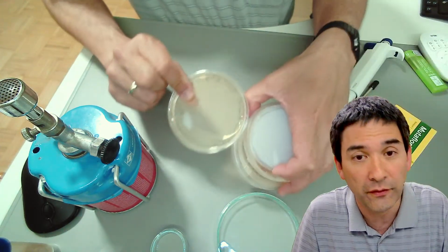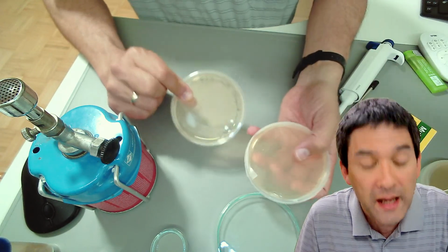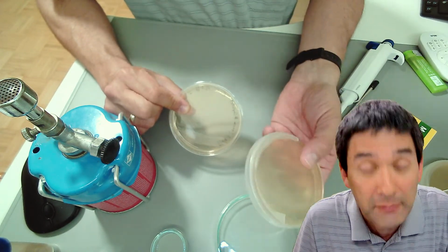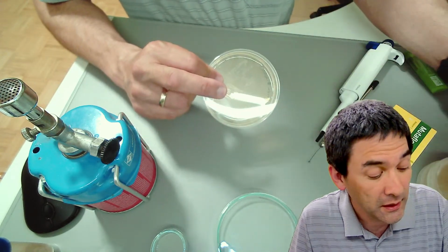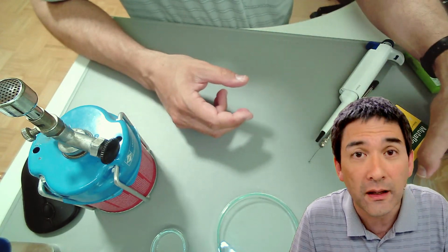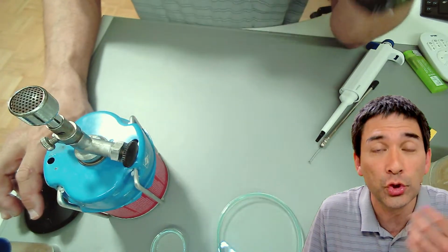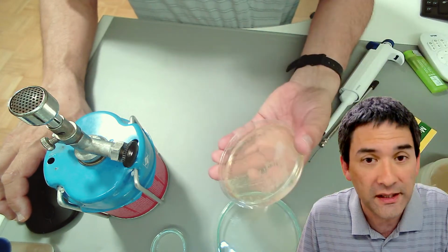And those agar plates that I've got here, I've got a few of them that I'll be using. They are commercially made. I actually bought them on Amazon, ready-made, with the medium already in them. But normally what you would like to do is make them yourself. I did so a few weeks ago, and I would like to show you now a video of how I prepared and made those agar plates myself.